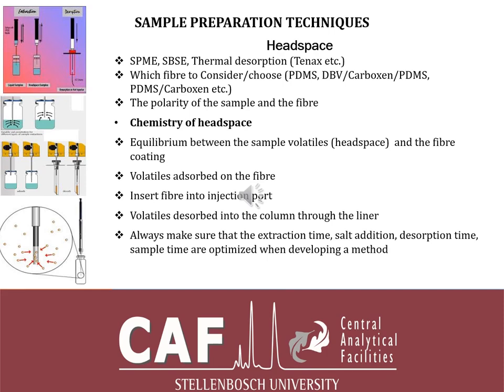In SPME, there's a chemistry of the headspace. It's important to understand that there is an equilibrium between the volatile compounds and the headspace coating on the fiber. What happens is that the compounds of interest get adsorbed on the fiber, and then after some time the fiber gets inserted into the injection port, and then the volatiles get desorbed into the column through the liner by the flow of helium that can be used as a carrier gas, or let me say the carrier gas.